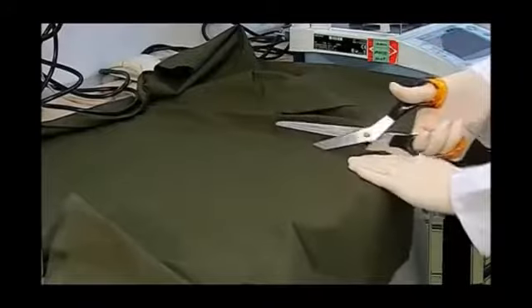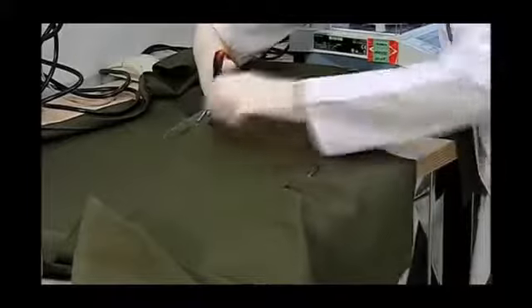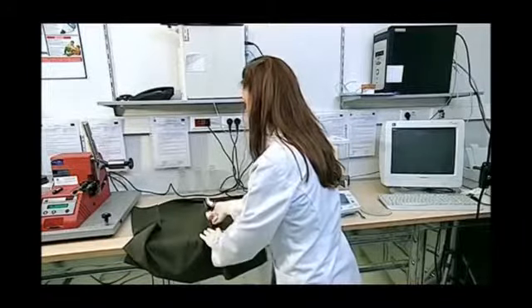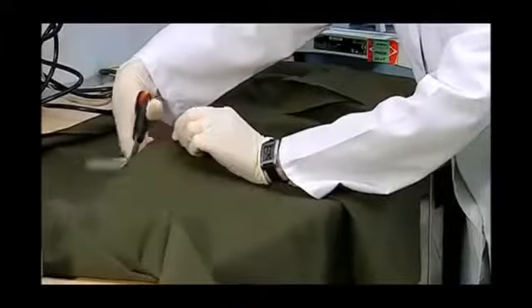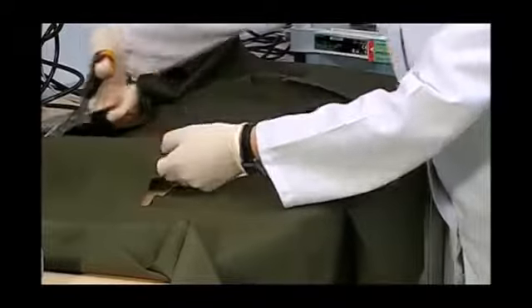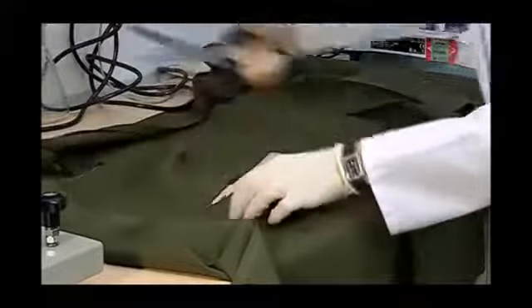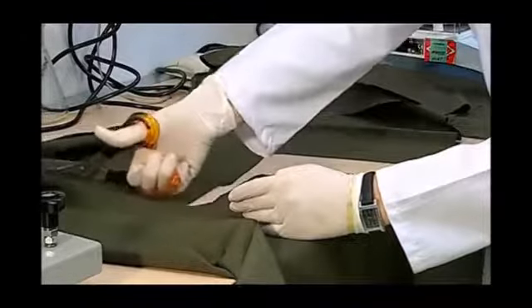For the purpose of representing all the samples, we make sure that they contain different warp and weft yarns. In addition, it is very important that our samples are conditioned in standard atmospheric conditions before being subjected to the test.